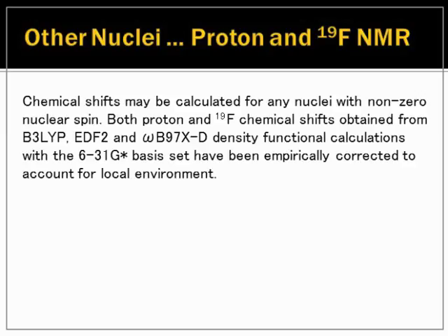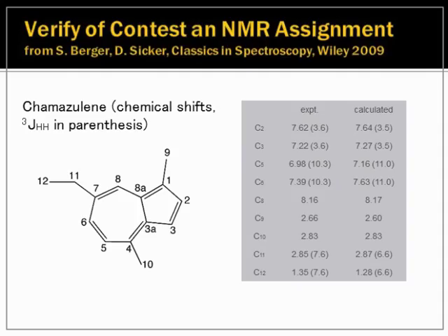But of the finite ones, whether you're proton or F19 or phosphorus, everything falls out of the calculation. We've carefully worried about proton and also about fluorine. We've done the same kinds of empirical corrections for those. They're both much simpler because you don't have the variety of bonding environments, but we've done the same kind of correction schemes for that. And here's an example of a corrected one.